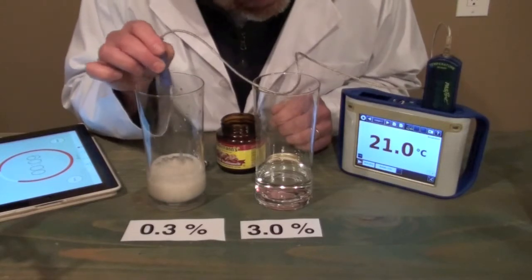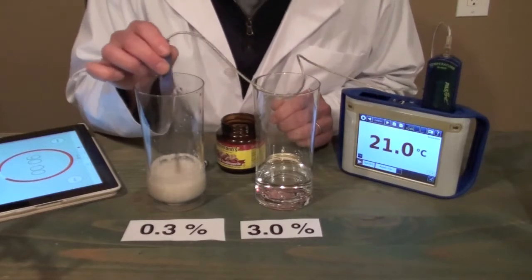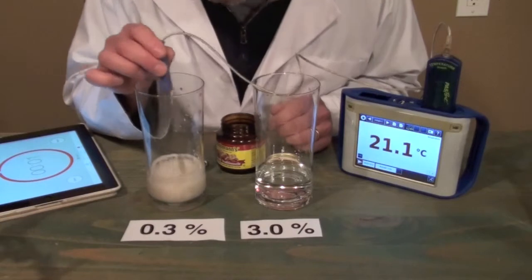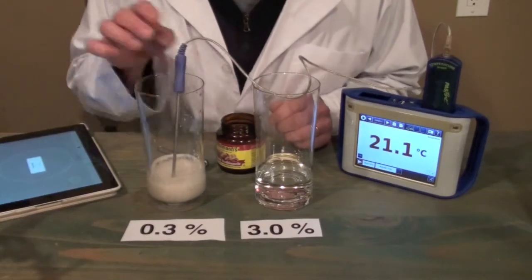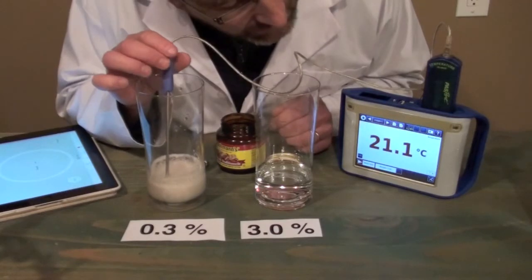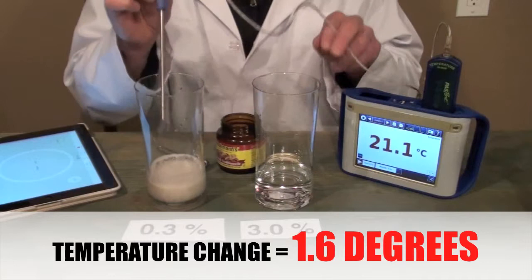Okay, 10 seconds left, and we're almost done. And it looks like we're done. And we have reached a temperature of 21.1 degrees. Now we'll just repeat that.